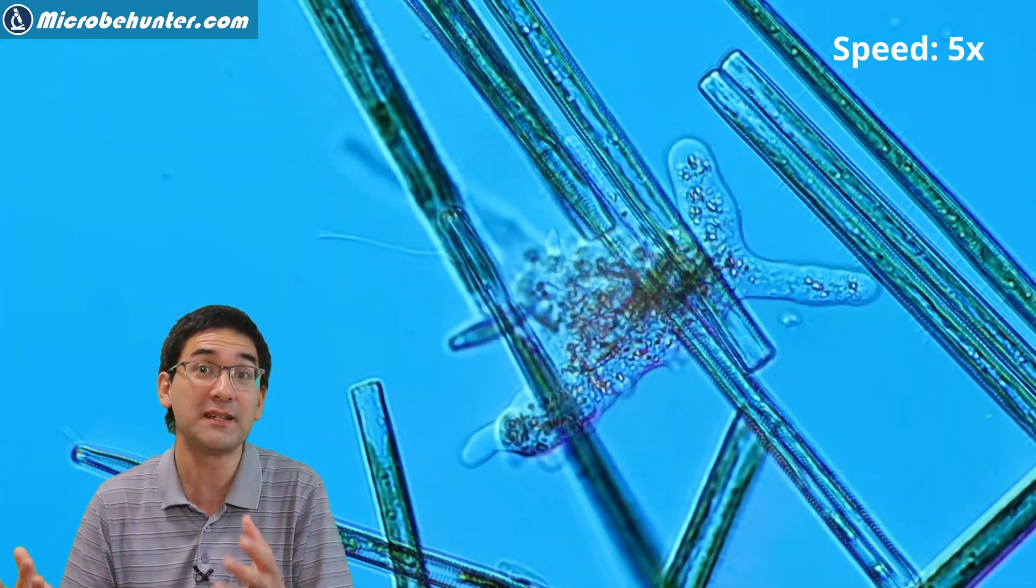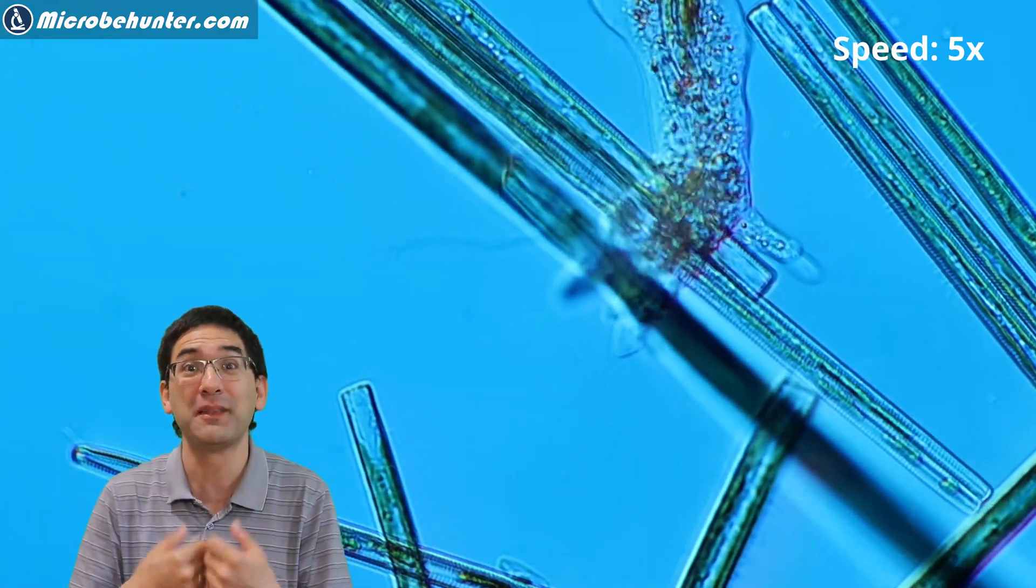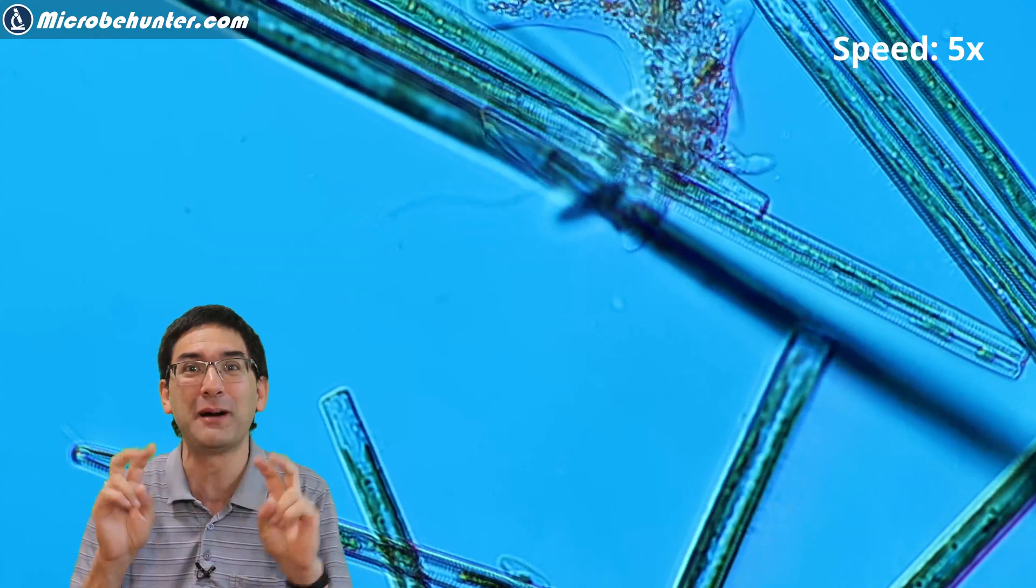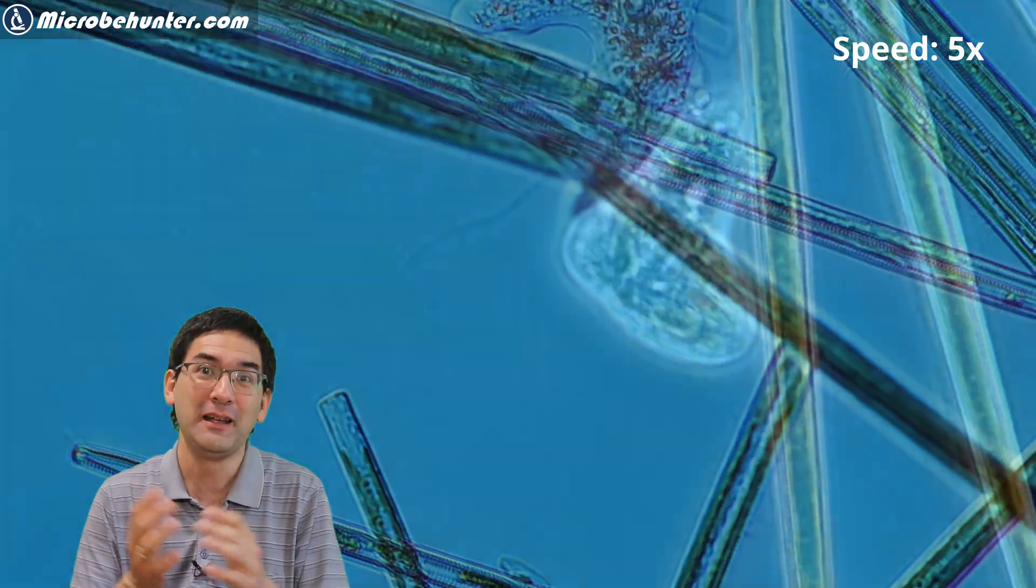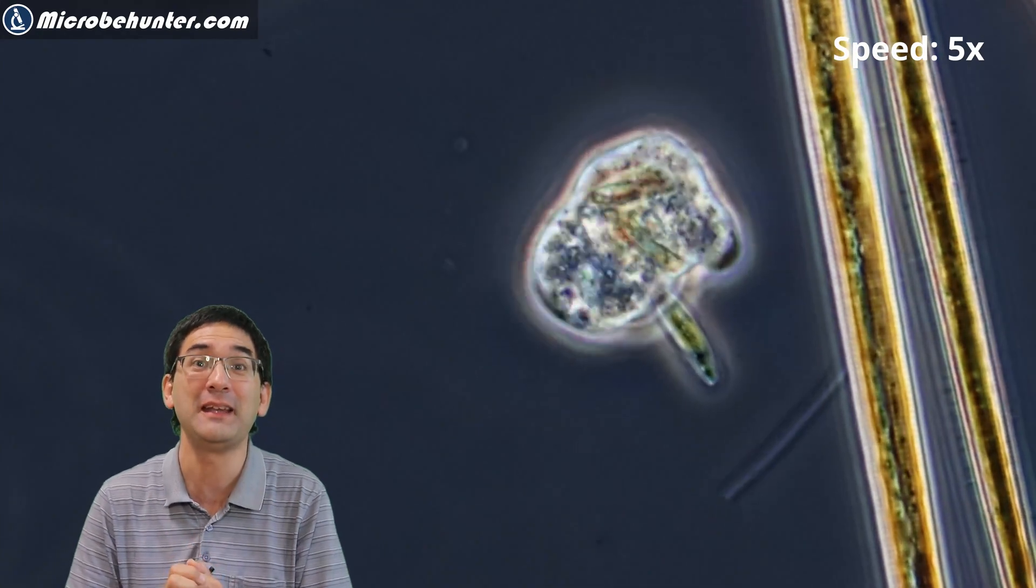Therefore, I've seen that some of those amoeba actually pooped out, or did something called exocytosis, to use a biologically more correct term. Even here in phase contrast, look, it's actually quickly expelling a smaller diatom.